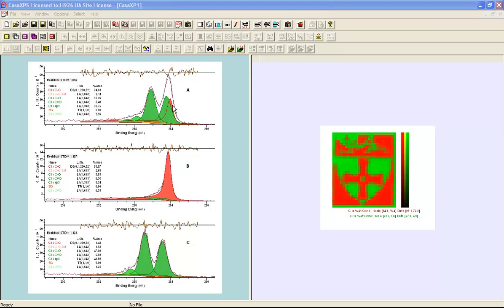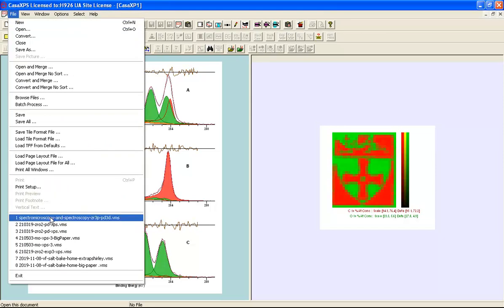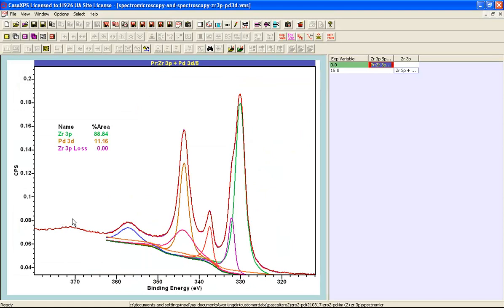So in this video I'm going to illustrate how colours can be assigned to these component peaks using the components property page. The example I will now use is a pair of spectra that have been fitted using a set of components. They are bell-shaped components for the most part. There are actually background components in the peak model also, but the idea is that we would like to indicate the different peaks that are related. In this case these are doublet peaks, so I want to relate doublet peaks together, and also a pair of peaks that represent loss structures.